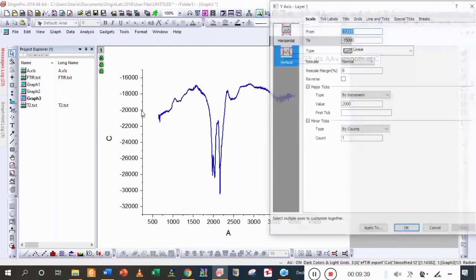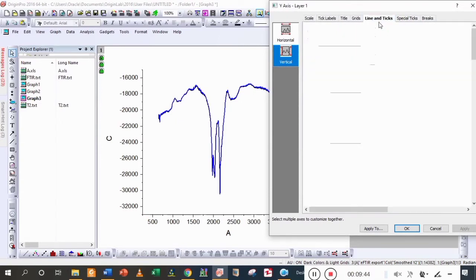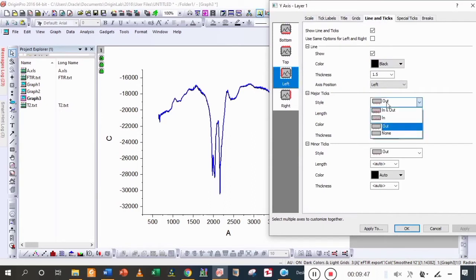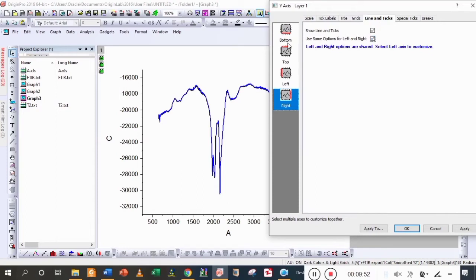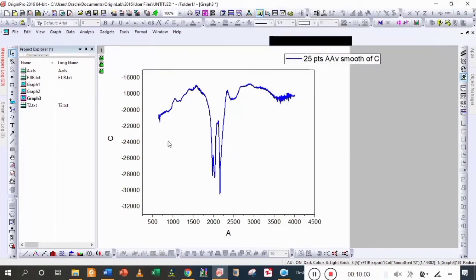So firstly we rescale its scales and lines and titles. So you can choose the same or with your own desire. Here none. Okay, so I'm going to delete the intensity value, because intensity is in 100% values. So we just write its unit, transmittance, and its unit is percentage.